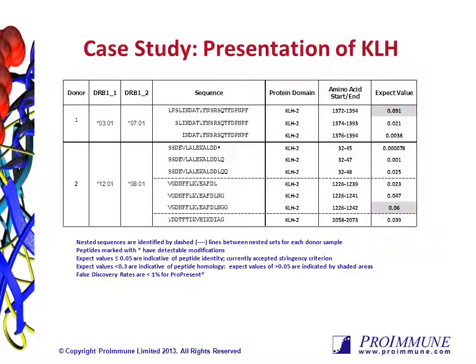The fact that you see such sequence nesting is also a good indication that the peptides identified are real hits. The sequences still have to be confirmed to be T-cell epitopes in T-cell assays, but at least we know that they can be seen by T cells, so they could well be relevant epitopes.